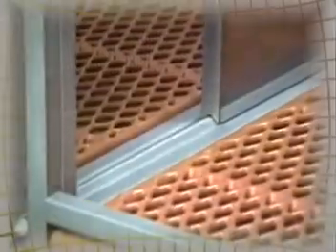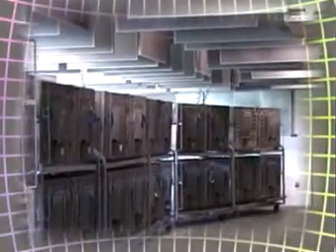Modular kennels to house a wide range of large animal species. Primate cage units and enrichment systems available in a wide variety of rack configurations and cage sizes.